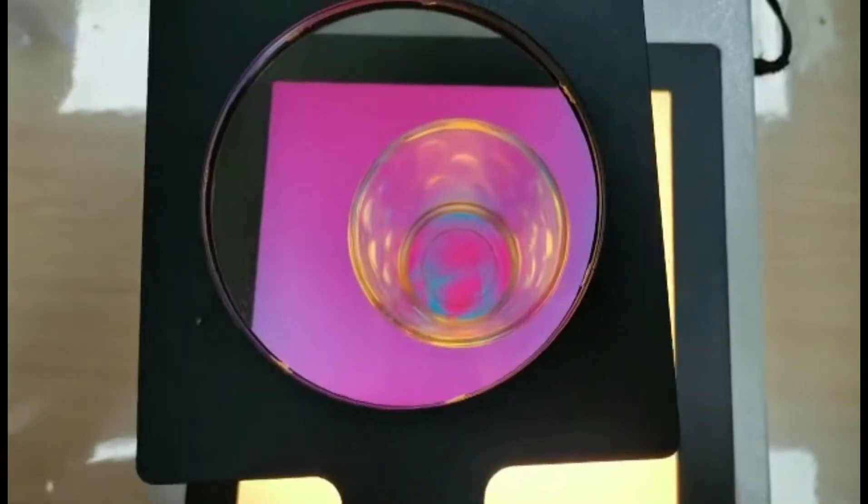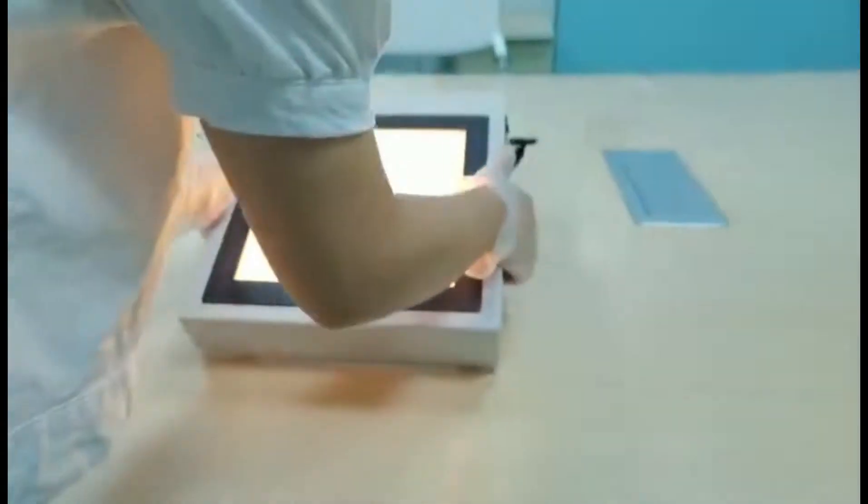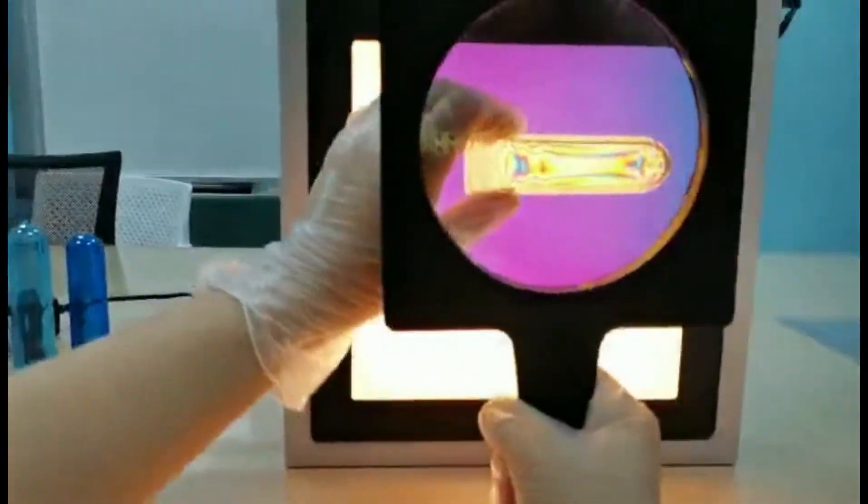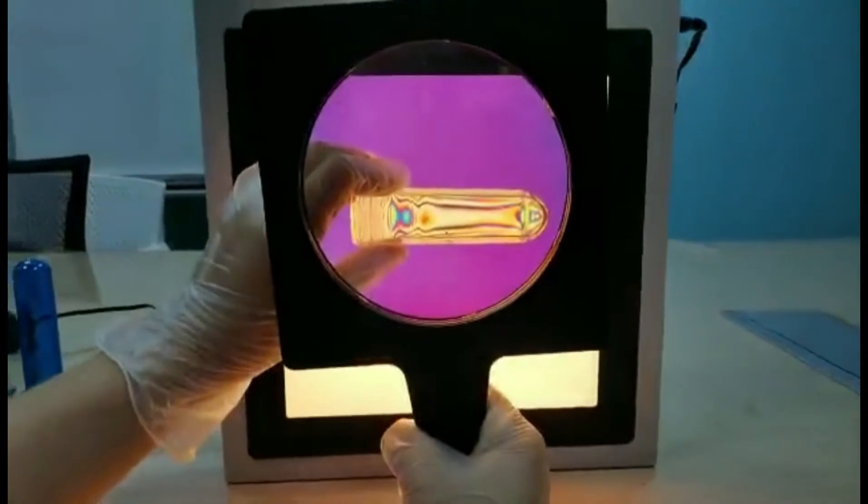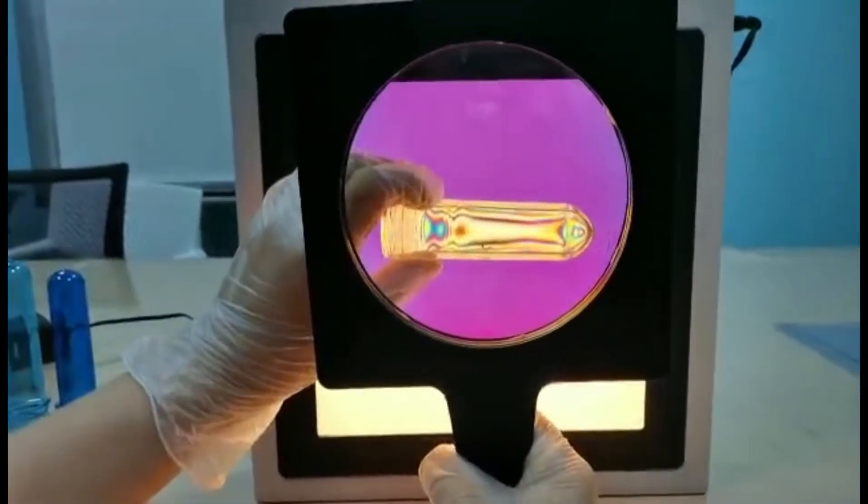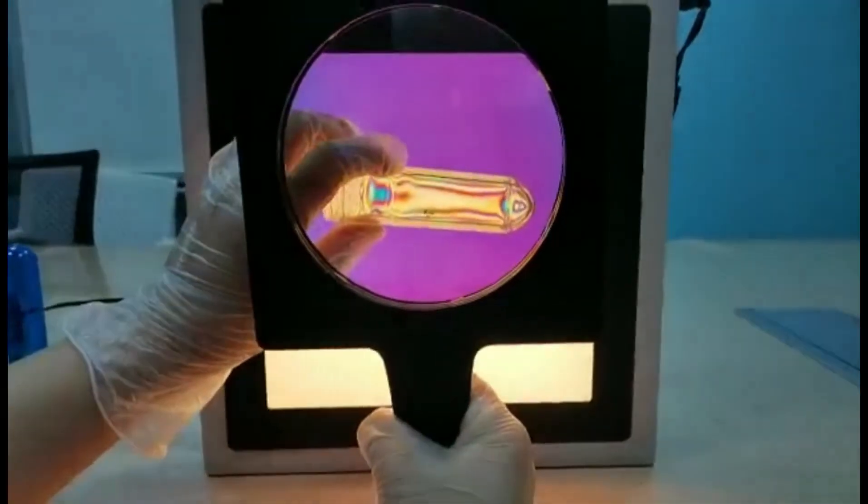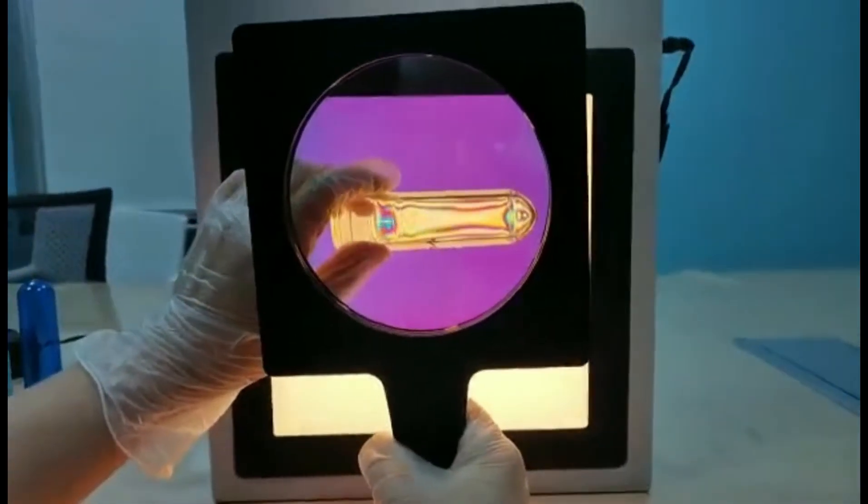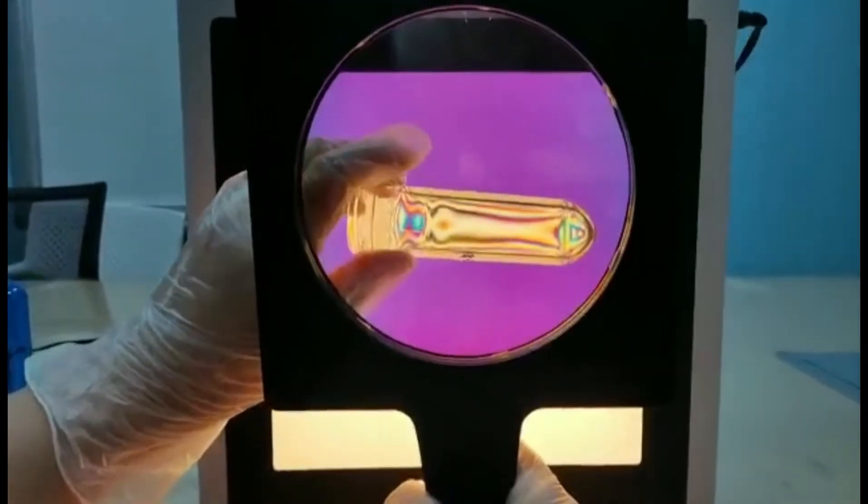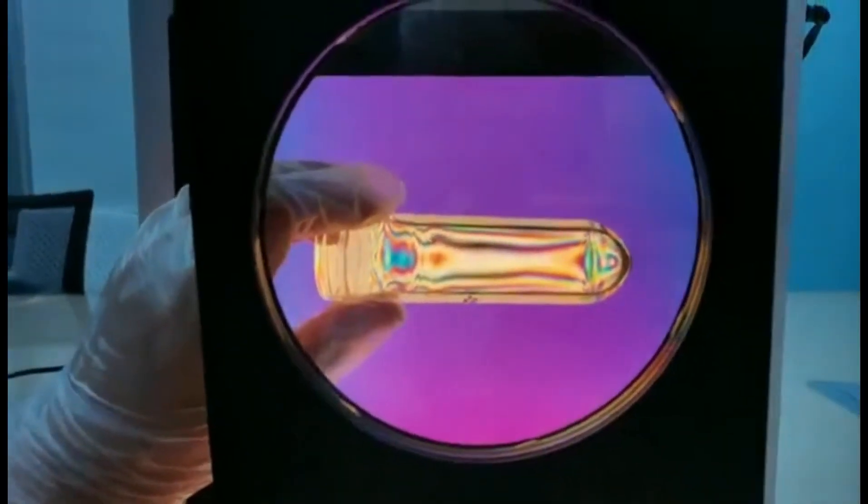Also, the polarizer can be placed in this way too. When we hold a preform between the analyzer and polarizer, we can see clear colored parallel strips on the side walls. This means this preform is in good condition.